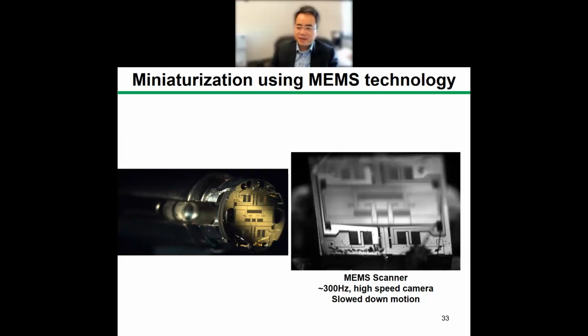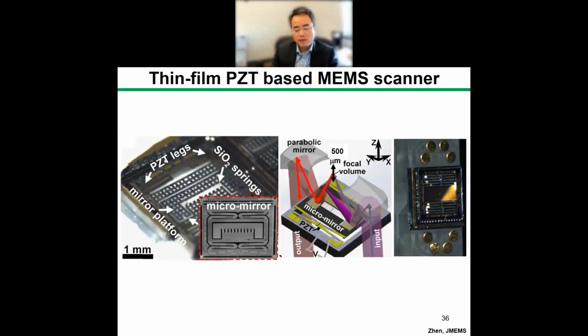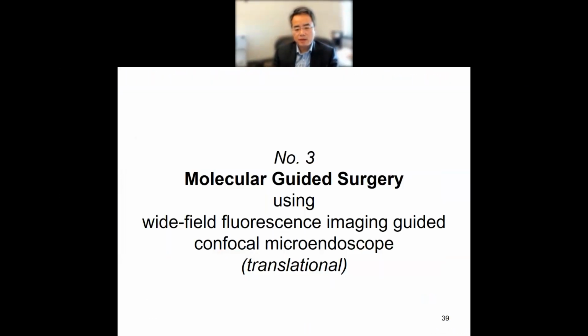Great, thank you. I have one question. You seem to have two different techniques to enlarge the field of view. One is to improve the hardware. The other is to stitch those views together to achieve a larger view. But how do you actually handle the motion? Because it's a live organ, a live specimen, there's going to be some motion.